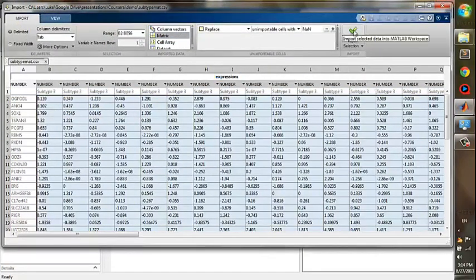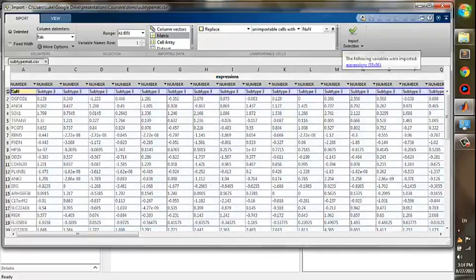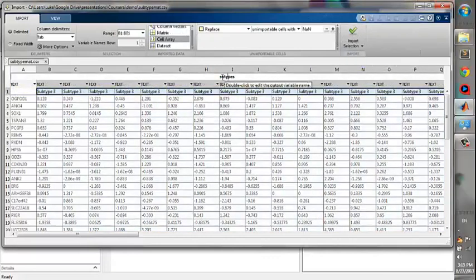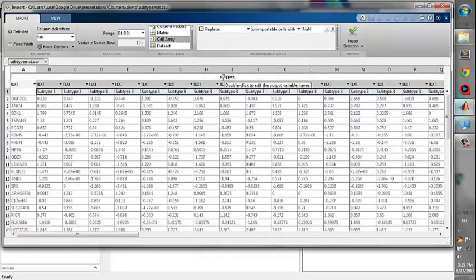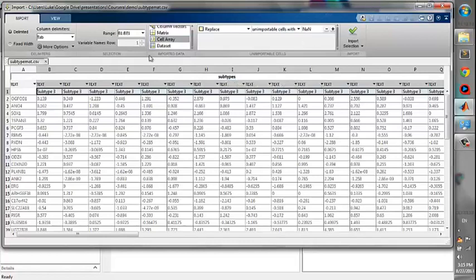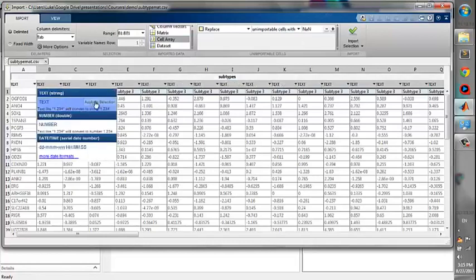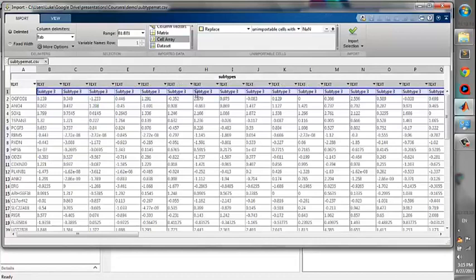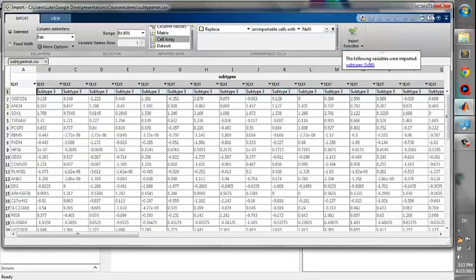The next step, we import the column labels. We give the name as subtypes and we import them as a cell array. And the data type should be text. And then click Import.